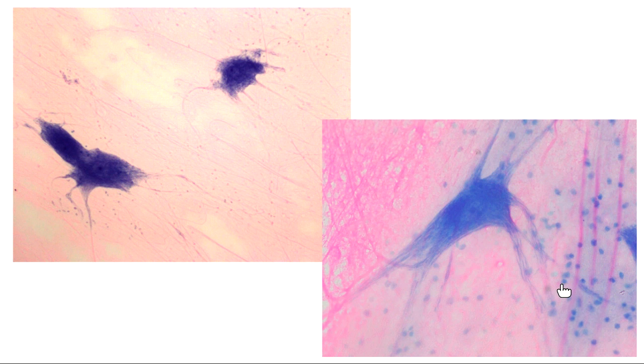And there was a note, I'll type it here on the side too, in the guided lesson, says to compare this to fibrocartilage connective tissue. Now, to be fair, it's not like they look super similar, but let's see if anyone happens to remember. I know we're hopped up on lecture, so we might not remember. Does anyone remember what colors we saw on fibrocartilage connective tissue? Any ideas? Yeah, blue. So it's blue and it's pink.